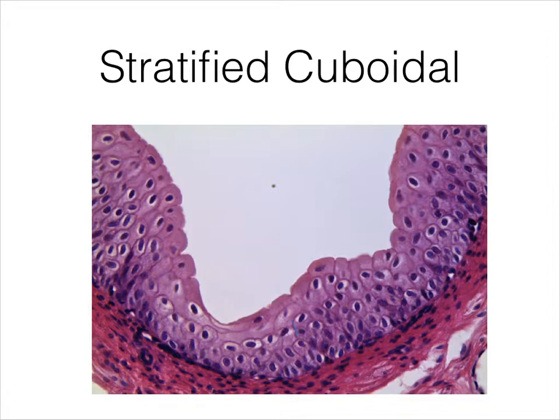So this is a cell, this is a cell, this is a cell. This down here is a cell, that's a cell right there. Here we have a cell. A bunch of cells packed close together with no space, no extracellular matrix, no fibers in between them.